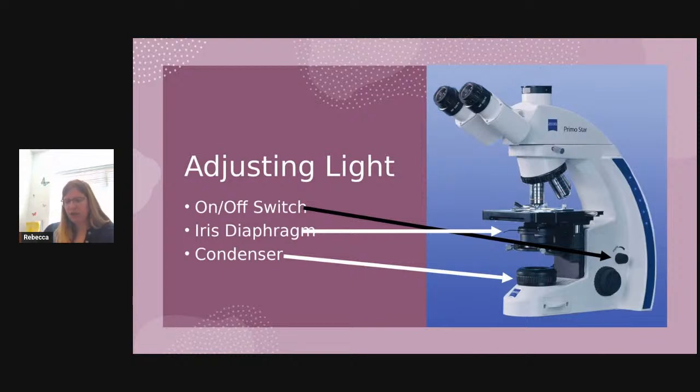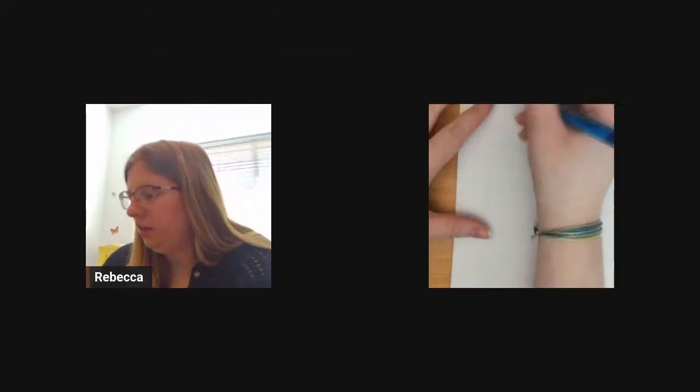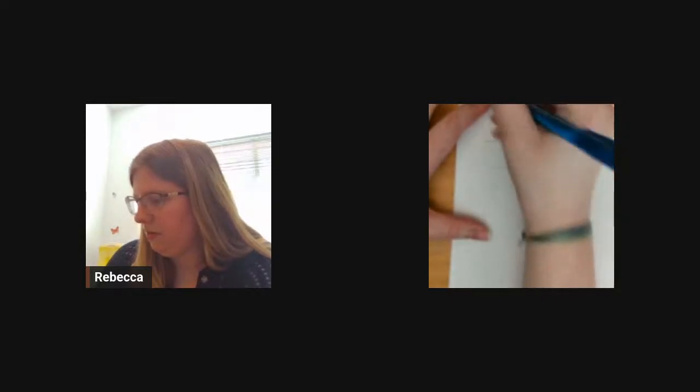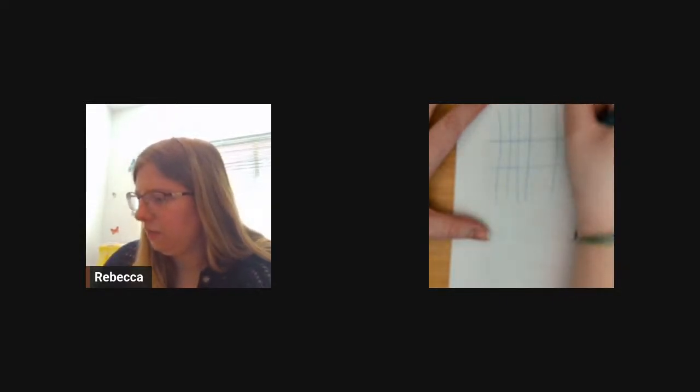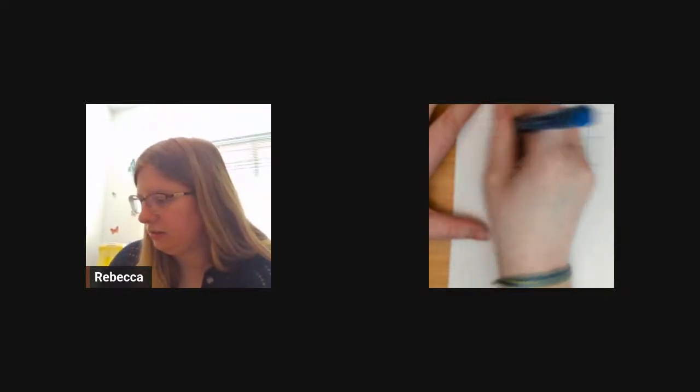And you, of course, should always start looking for your grid on 4X, and you'll probably see the entire grid, right? And so that entire grid looks something like this.